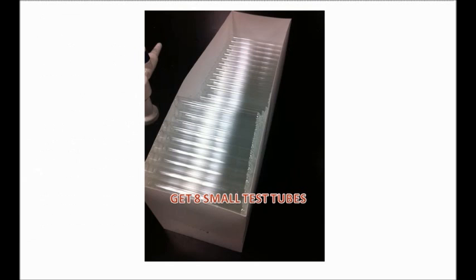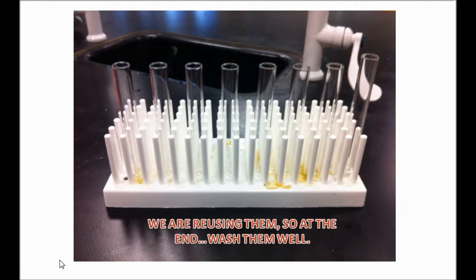You're going to take 8 small test tubes from the supply table and place them inside the test tube rack. We are reusing them after each period. So at the end of the period, I expect the test tube racks to look like this. Wash the test tubes well, rinse them off, and let them air dry. It's fine.